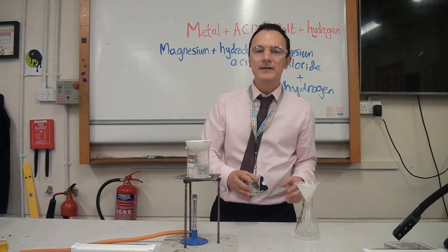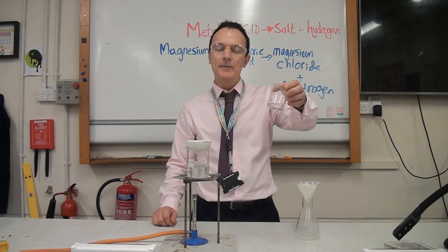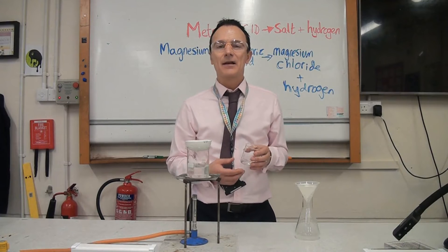This has had about 15 minutes to react now. We can see it's finished reacting because it's not bubbling anymore — it's no longer producing hydrogen. That's because all of the acid has been used up, since we added excess magnesium.